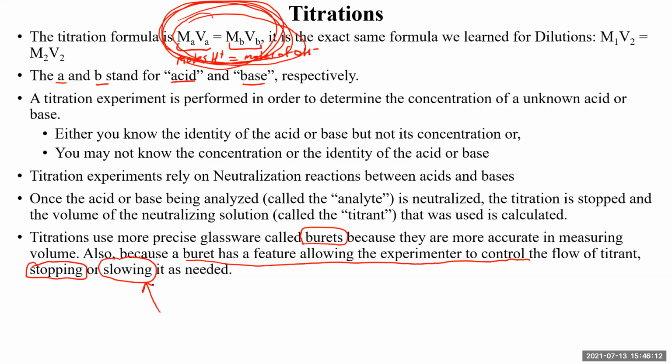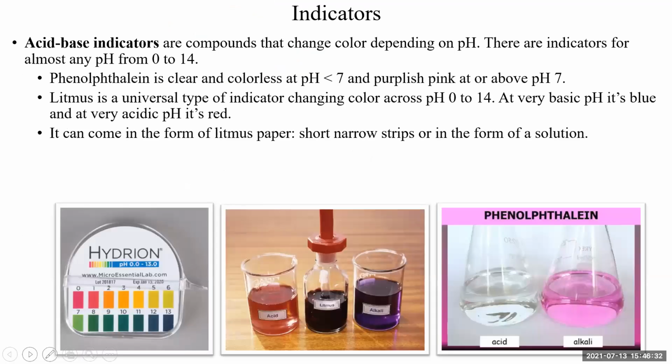So you can significantly slow down and control the mixing, how much of the solution you mix at any one time, so that you never have to add more than a drop extra, so that your error is controlled when you're dispensing solution. So this will make more sense when you actually see the pictures.